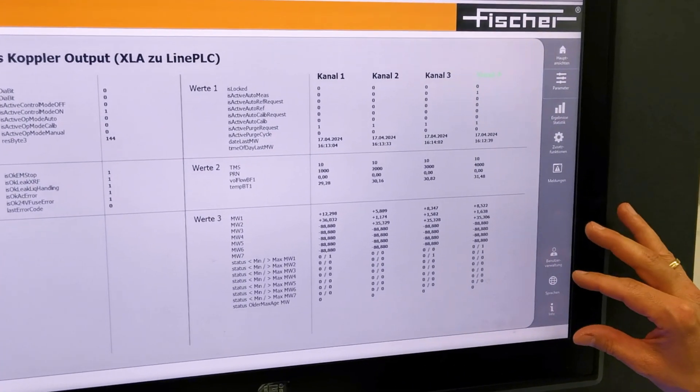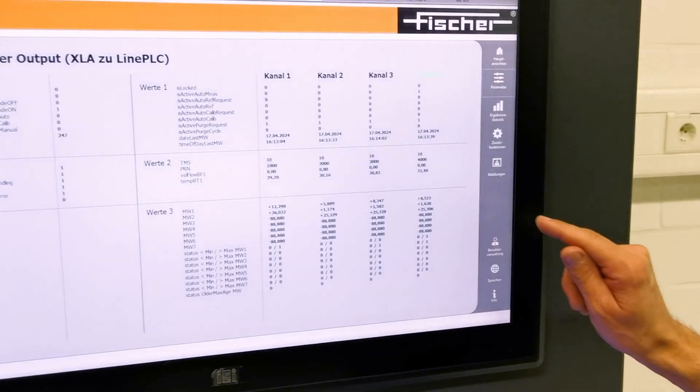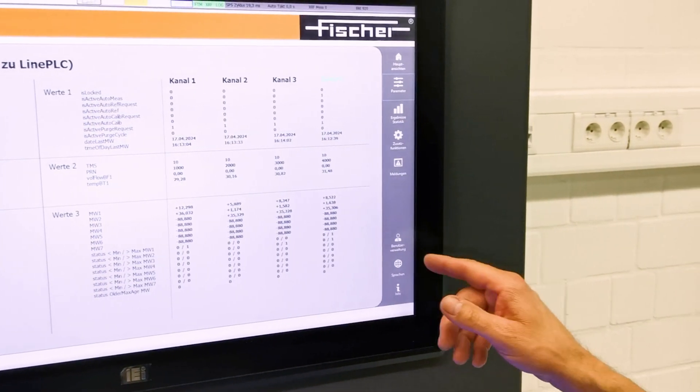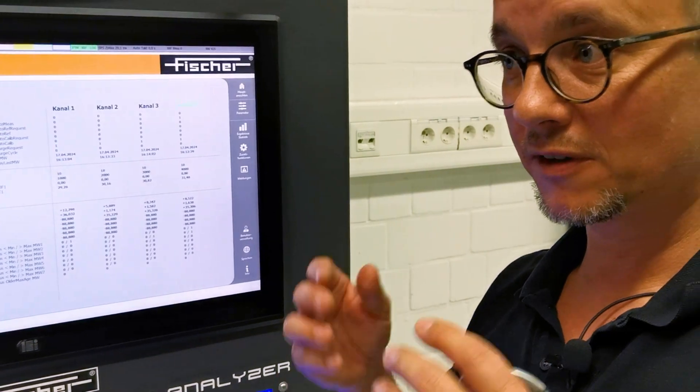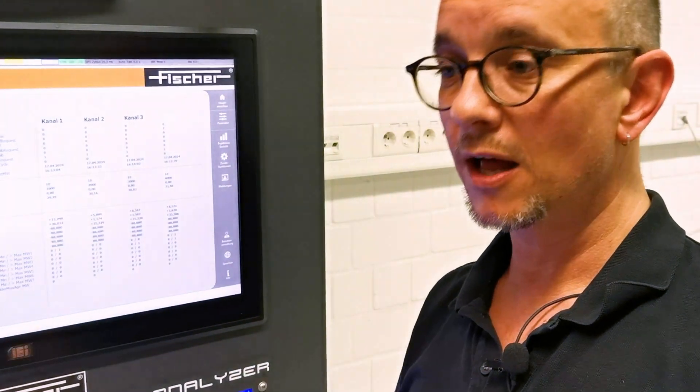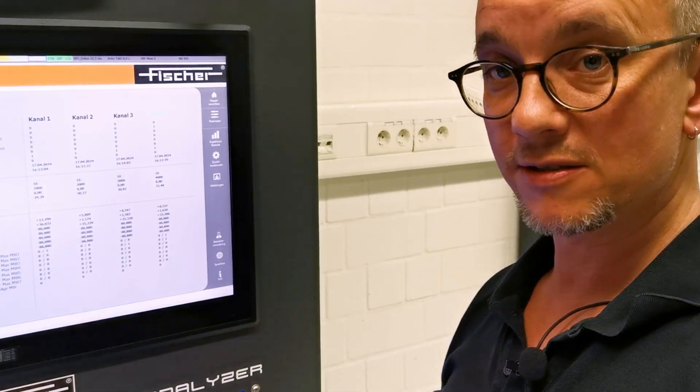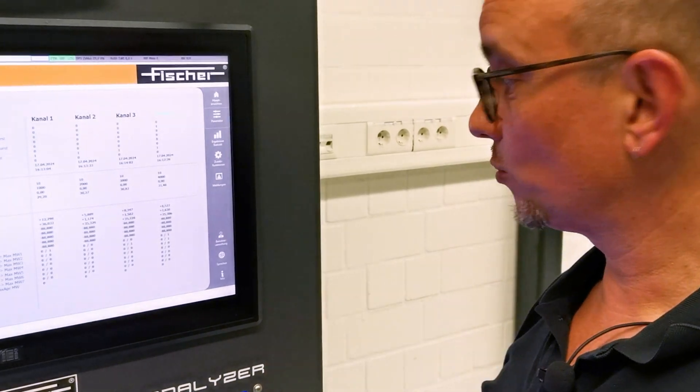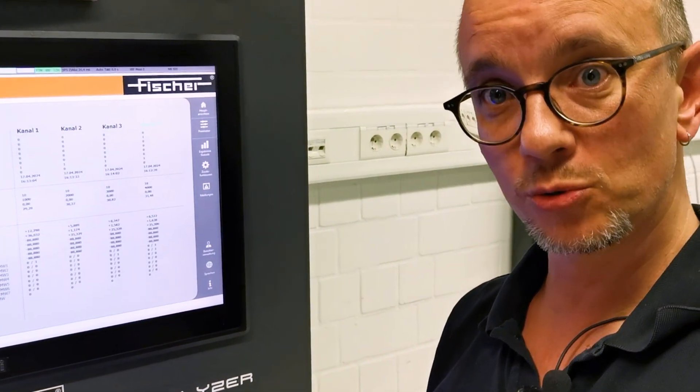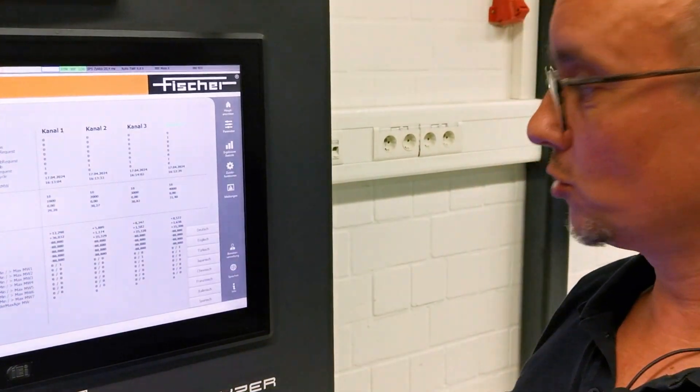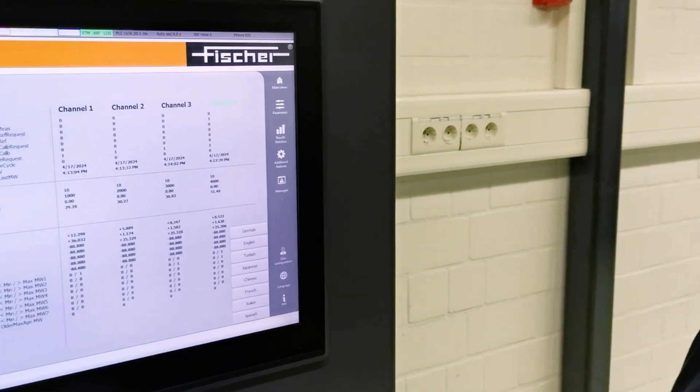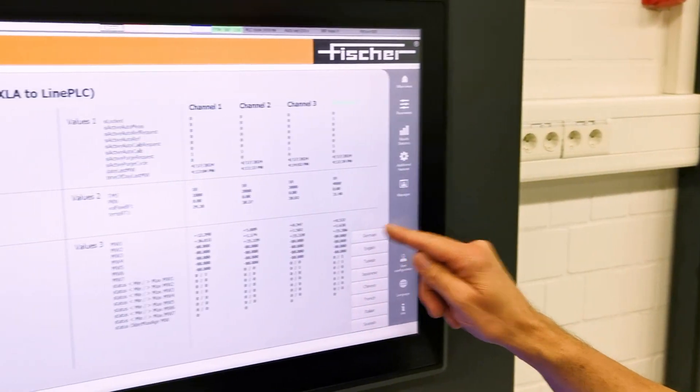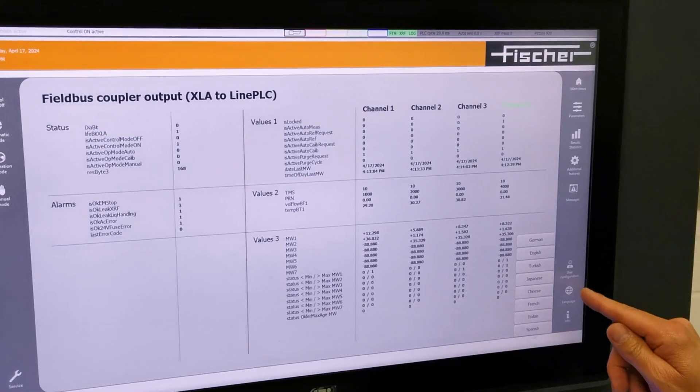And then on top of this, an operator administration allowing you to give different personnel different access rights to the instrument with four different user levels. And, for sure, the languages. I could switch to English, Turkish, German, whatever is needed during runtime.